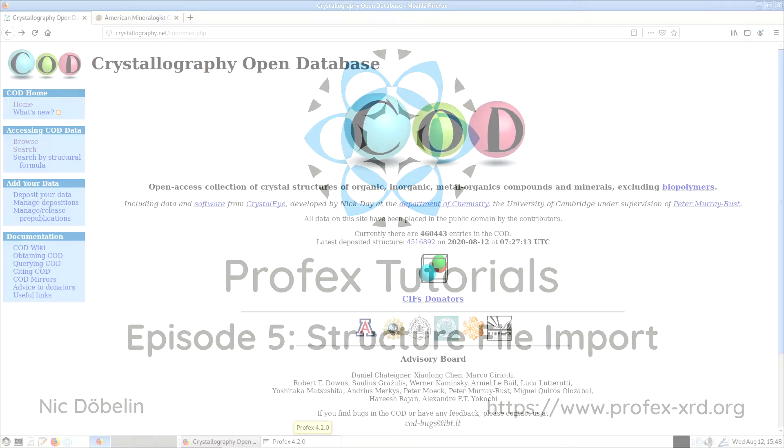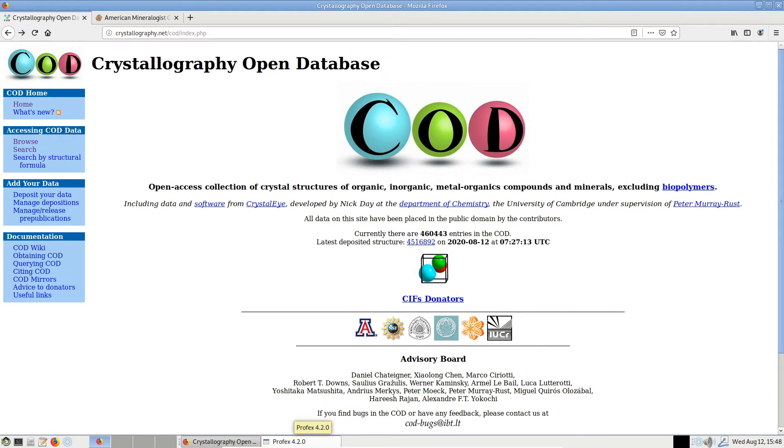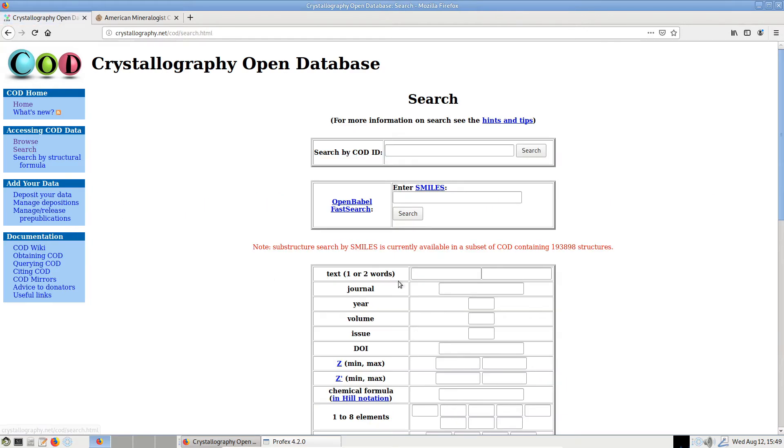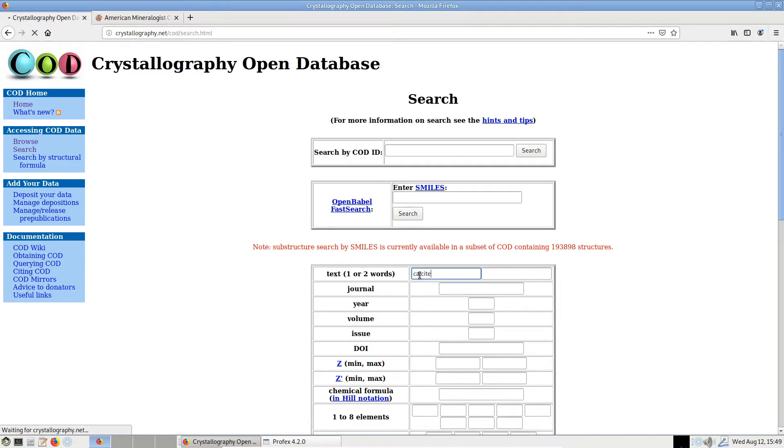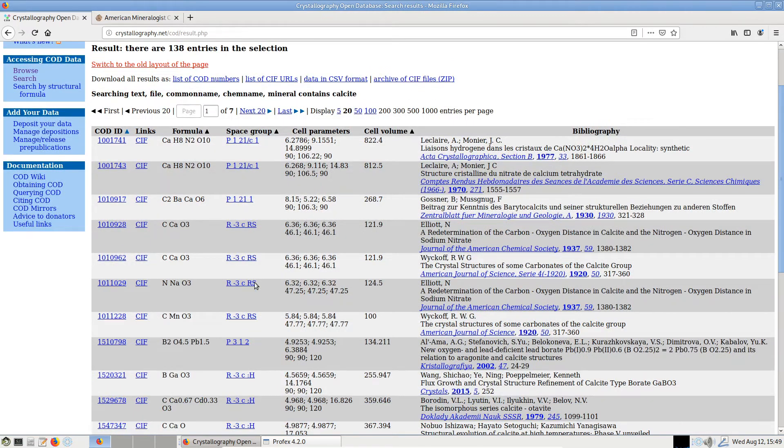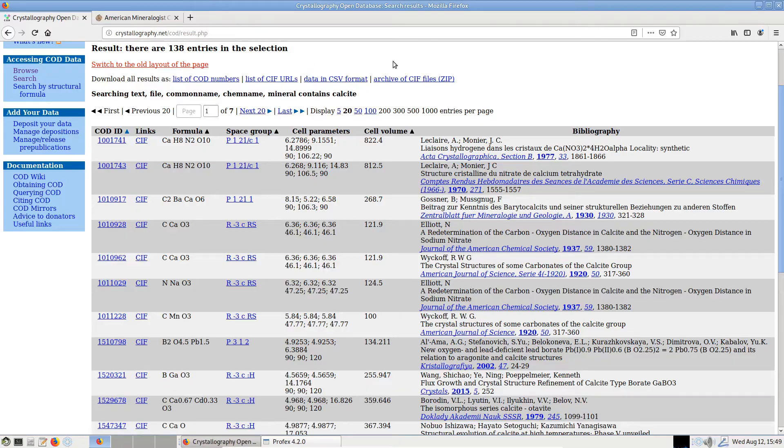There are a number of free and commercial databases for crystal structure information, and one of the free and most popular ones is the COD which we can see on the screen. We can search the database for mineral names, for example. I will just download a few structure files for importing into Profex, and we can start with calcite. We get 138 matches.